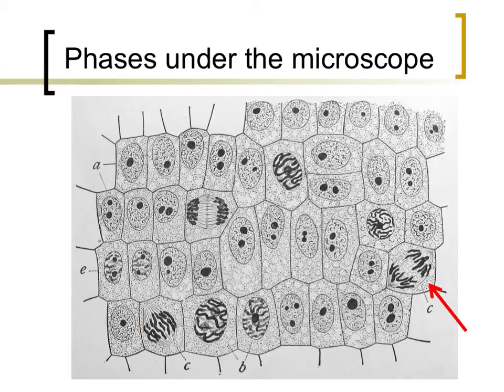Anaphase, the third phase of mitosis, looks, at least in my opinion, like two spiders as designated in the cell to the right. During anaphase, spindle fibers pull chromatids towards centrosomes, giving this phase of mitosis its distinct appearance.